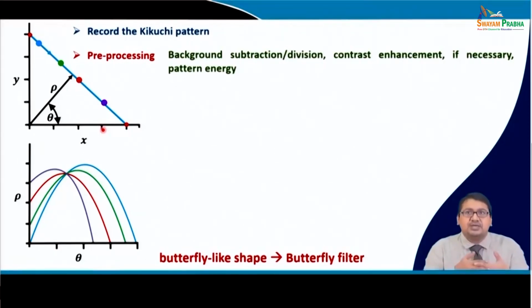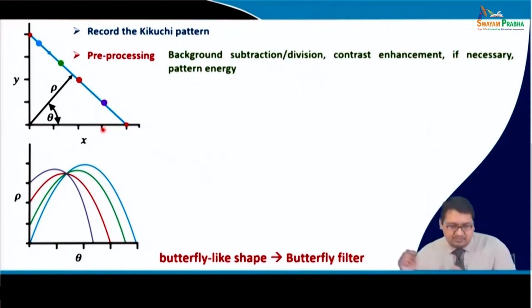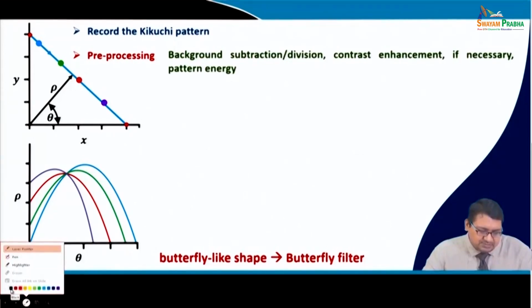So, that we can get the rotation matrix between the crystal frame of reference and the pattern frame of reference, and the pattern frame of reference to the sample frame of reference, and that is how we find out the orientation. Now, let me take the pen initially, and let me try to show you what I want to show here.